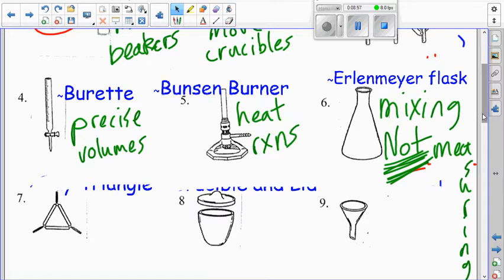These numbers, it even says approximately right there, are just ballparks, okay? So Sarah's like, oh, I got like 150 milliliters of stuff. Can I use this one? Like, it can hold about 250. Okay, yeah, so this one should be good to go. But another time, Sarah might be like, I have 400 milliliters. Can I use it? Yeah, this one's probably not big enough because it holds about 250. So this is just a ballpark to let you know the general size, but you should never measure with one of these. You should only mix.